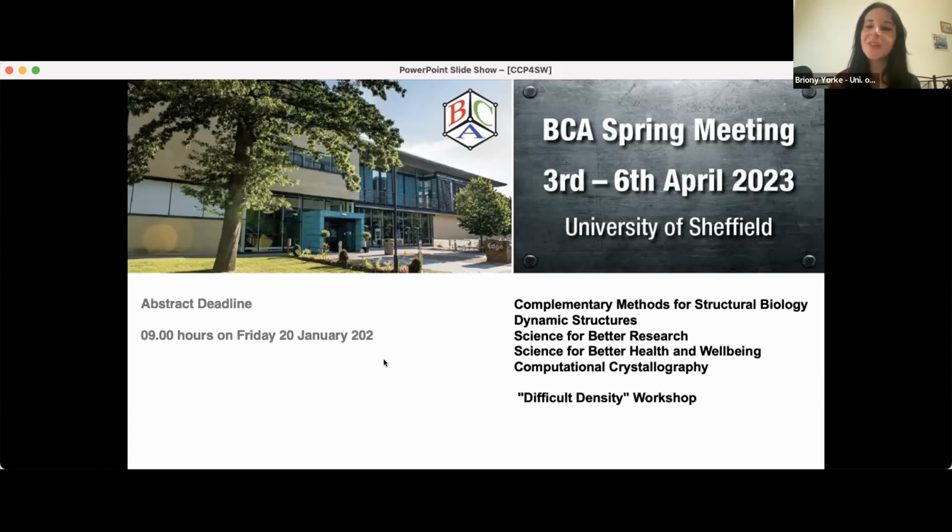And then because the determinant of the Hadamard matrix is as big as possible with a distribution of zeros and ones, you do get a smaller sigma. But the assumption is that any weighing of a combination of objects has the same precision, no matter how many objects you pile up on that weighing balance. So with X-ray measurements, this is not the case because they follow Poisson statistics and the errors are not normally distributed. So you probably get a gain, I agree, but it's not as good as the theory would say.